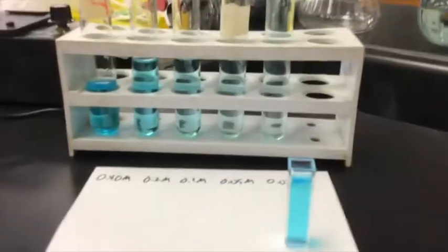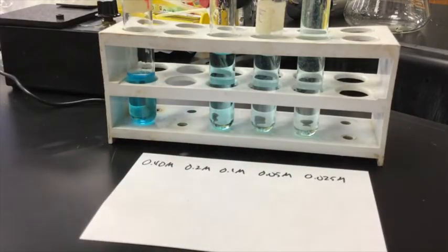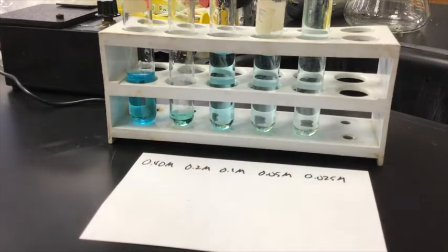I come back over here, get this out of here, and dump it down the drain. Now I'm going to get my 0.2. Put in the 0.2, dump it, put in the 0.2, dump it, put in the 0.2. Make sure that the outside of this is good and dry. I think I may have spilled a little on there. No big deal. I should be using a Kim wipe instead of a paper towel, but I'm not.